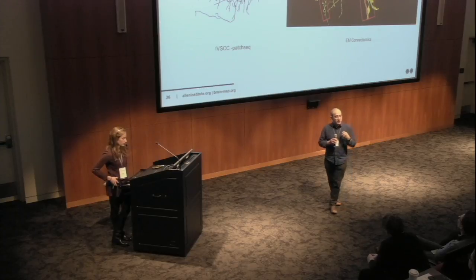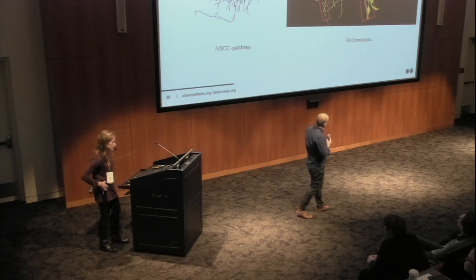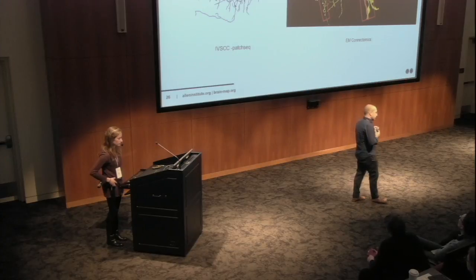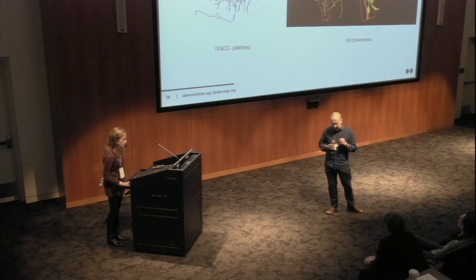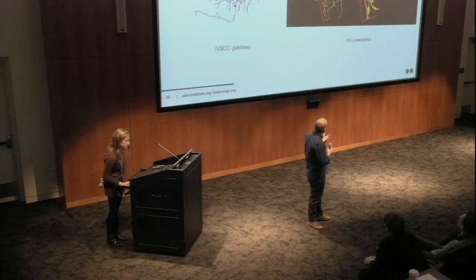And due to this speed, if the computer gets reanimated, you'll be able to see that the quality that we get in these human samples is very similar to the one that we're getting in the mouse, which makes us very excited about the possibility of being able to reconstruct it and segment it in an automated way, in a very similar way to how we're successful in the mouse.